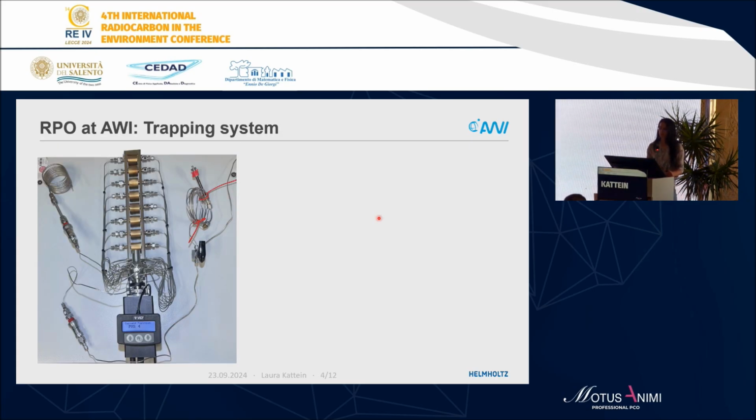This is what the system looks like in the lab. You can imagine the Solitox standing right next to it. And then the gas enters here to this 3-way valve, either into the atmosphere or through this tubing. And here you see the quick fit connectors onto our zeolite trap system. And then we can use this little remote here to choose the pathway of the gas.